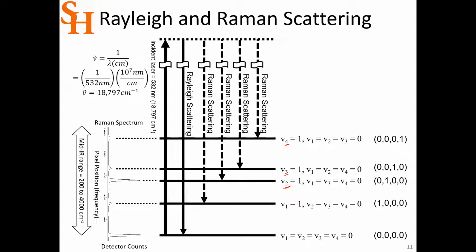So in the experiment where you had the polarizers in a vertical position for the incident and exiting light, those would be the symmetric modes, and he would start at the high frequency and label that vibration number 1, or nu 1, and then he would go down to the next highest frequency fully symmetric mode, and label that nu 2. Then he would switch the polarizers and label the peaks for the asymmetric modes from the high frequency to the low frequency. So that's how the numbering scheme for Herzberg works.